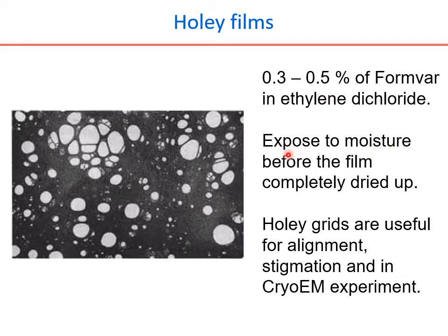The moisture breaks the plastic film at several places depending on the exposure, and those breaks appear as the holes in the film.